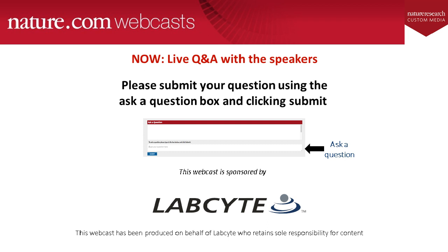Excellent. Thanks, Nur. And our next question asks, when transferring your primer at a higher concentration, do you compensate for dead volume? And how often do you typically go back to the same source plate? Jefferson?